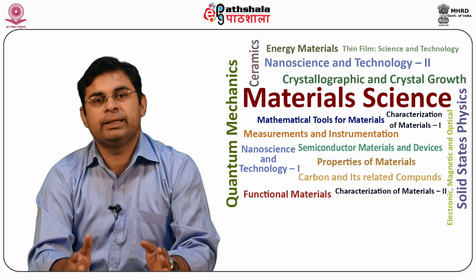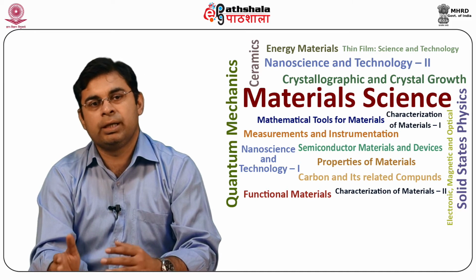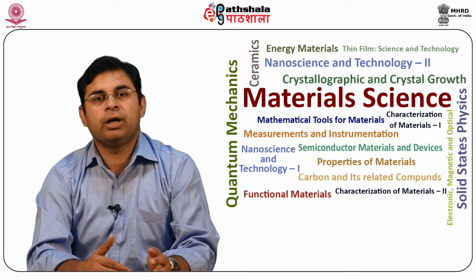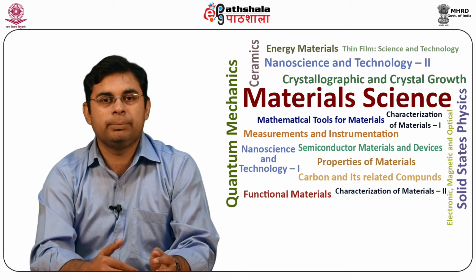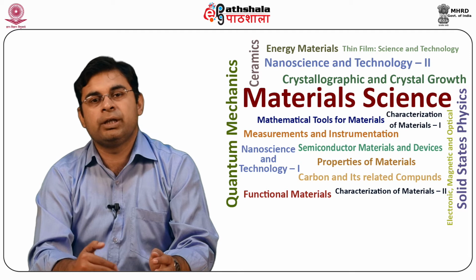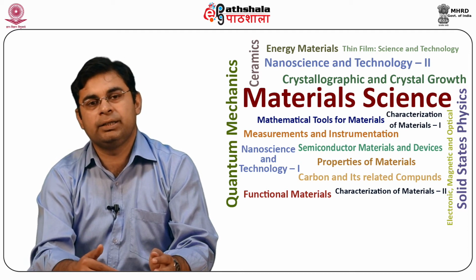This imaging technique is considerably different from TEM, SEM, and other optical methods. In these imaging methods, the source is quite far from the specimen. It may be an electron gun for TEM and SEM, and in optical imaging, it may be a tungsten halogen lamp or an LED.